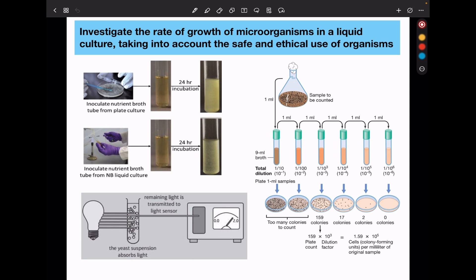In this experiment, the dependent variable is the number of microorganisms per specific time. You need to use aseptic techniques: washing hands with soap, disinfecting surfaces, and using a Bunsen flame while minimizing exposure to air. Then inoculate the flask containing the liquid microbial growth medium with the same concentration of microorganisms. Use a stirrer — this could be a magnetic stirrer — to ensure uniform concentration of microorganisms. This is immediately after inoculation. You could then place cotton wool in the mouth of the flask, or loosely cover the mouth of the flask with aluminium foil.